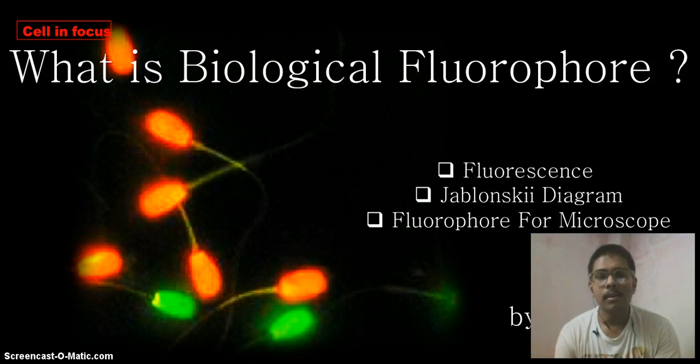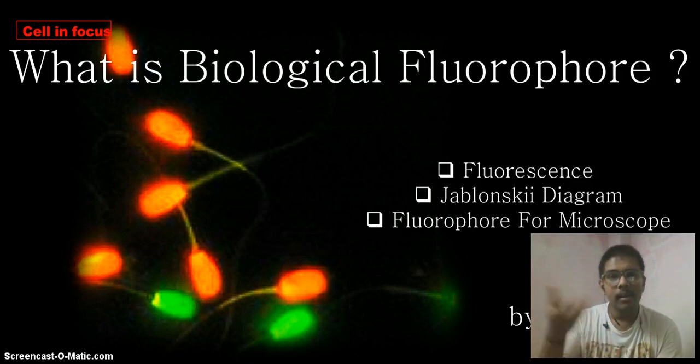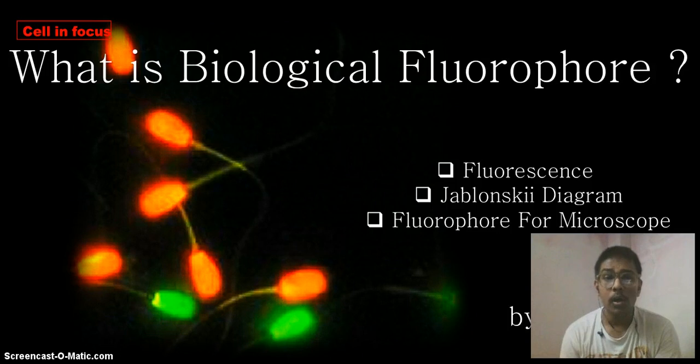Another important thing is whether the whole specimen is going to generate the colored light that makes the image, or only some particular point. To answer that, unlike TEM or SEM, here the whole specimen of your sample is not going to generate any electron or light.